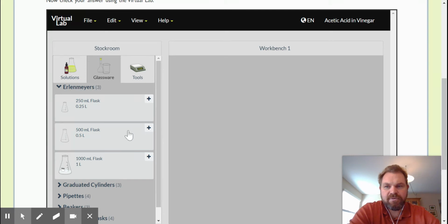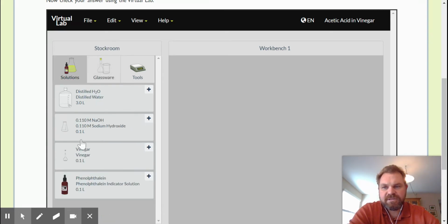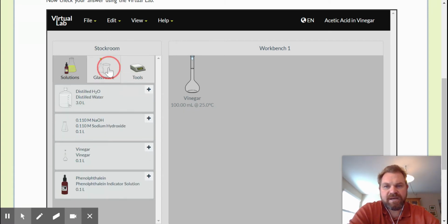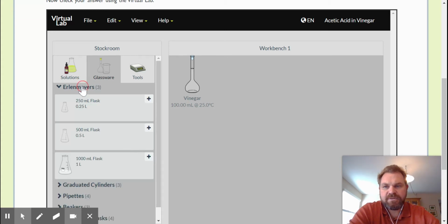So let's go ahead and find that in our stockroom under solutions. And we just click on it and it will add it to the workbench. And then we go back to the stockroom. We're going to add some glassware. We're going to do the experiment in a 250 milliliter flask.